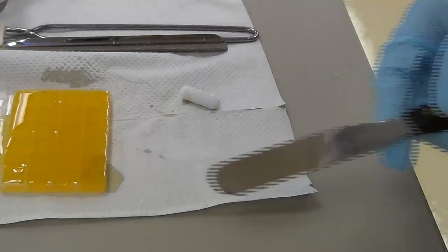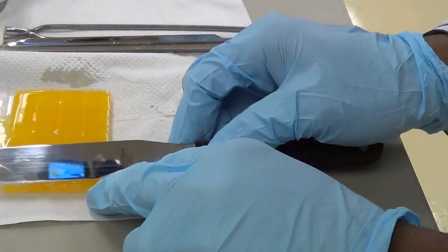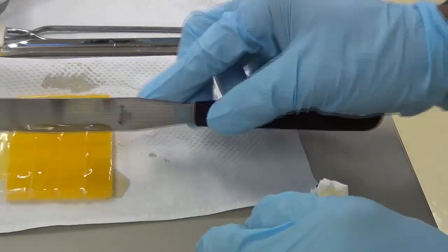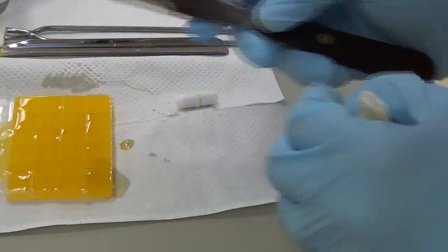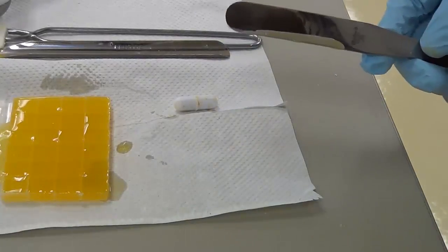Once you overfill the cavity completely, take a spatula and skim off the top, first in one direction and then in another direction, so that you will have a completely uniform amount of your mixture in all the troche molds. Let it cool for a while and come back.